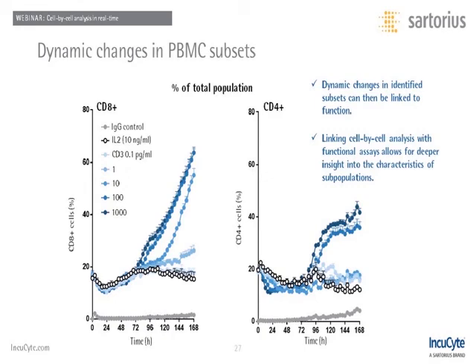The graph on the left describes how CD8 positive cells are much more responsive to treatment with CD3 antibody. At the beginning of the experiment, both CD8 and CD4 positive cells account for approximately 20% of the total population. There then remains a lag period of approximately 3 days, and post this we see an enrichment of the CD8 cells to over 60%.